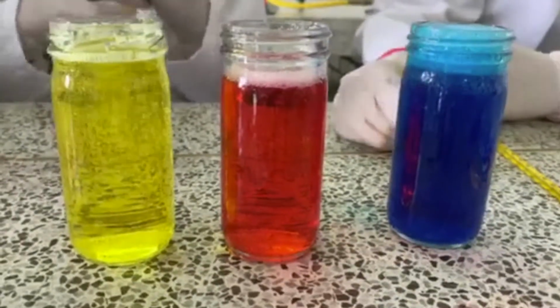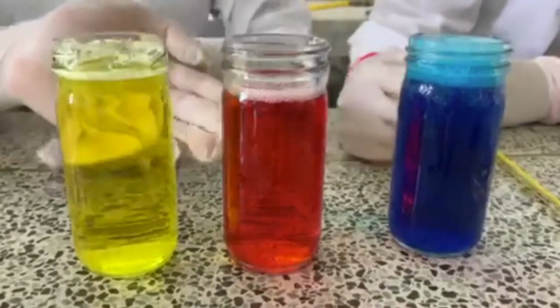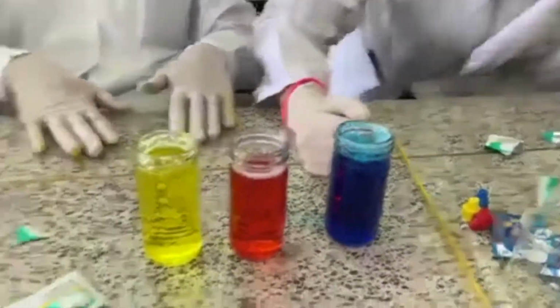After this, we have to add at the same time an effervescent aspirin to each of the vessels. Measure the time with the timer from when we add the aspirin until the end of the reaction.